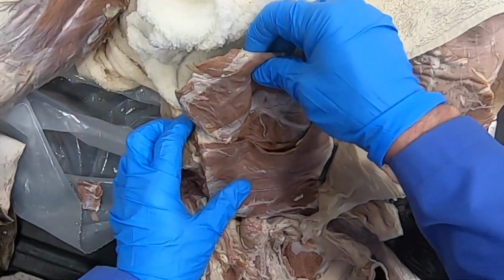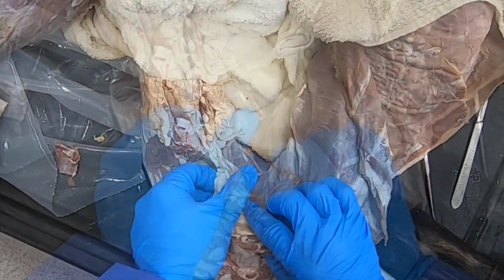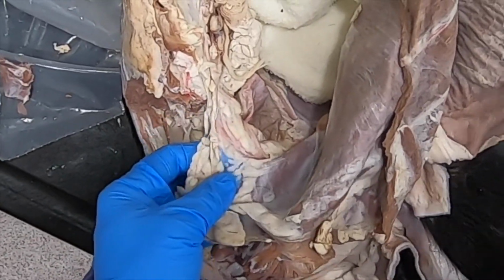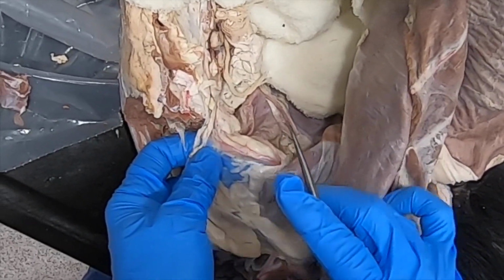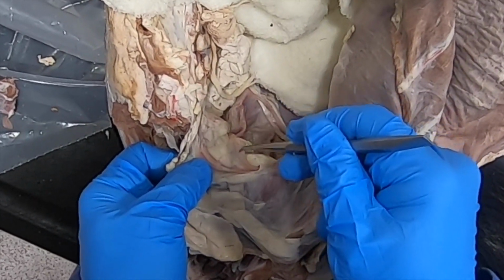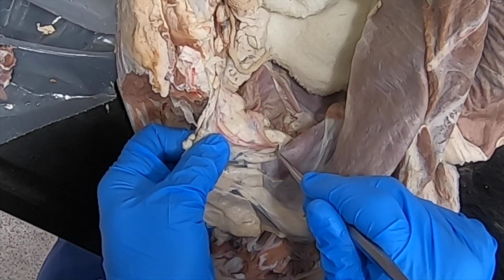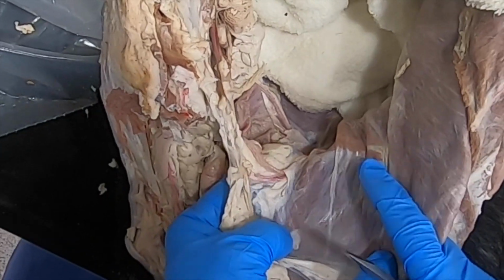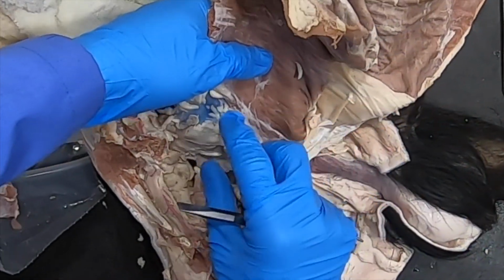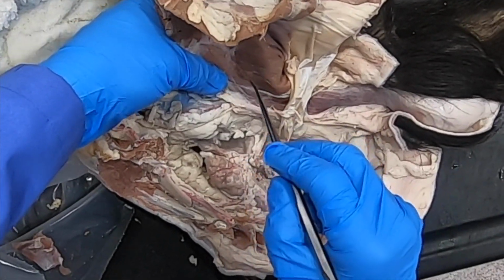Okay, so what I've done now is I've cut and reflected those abdominal muscles, and so we can see very nicely here. Here are the testicular vessels coming in, and here is the ductus deferens entering very nicely into the vaginal ring and then the deep inguinal ring. Okay, and so then see, there's those testicular vessels again right there.